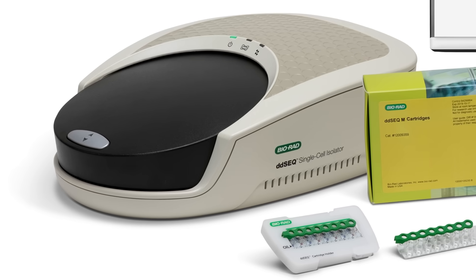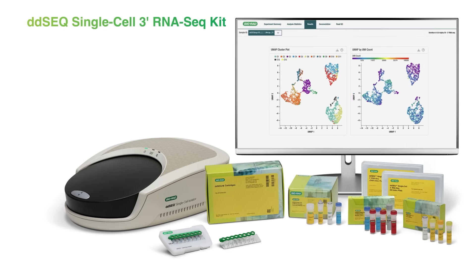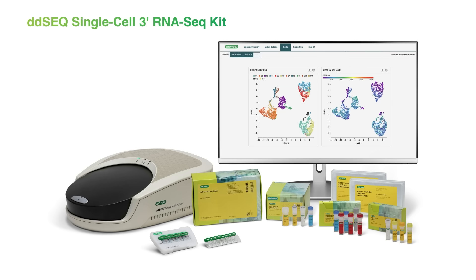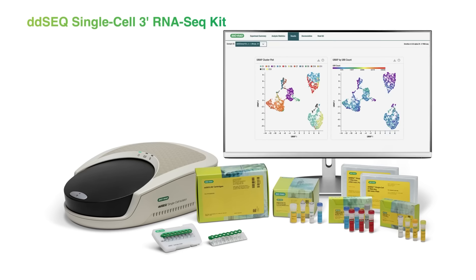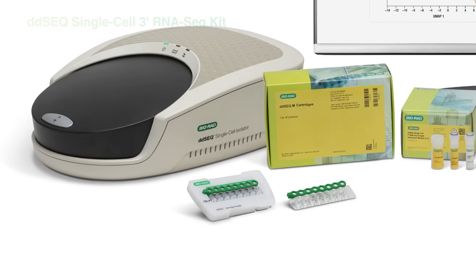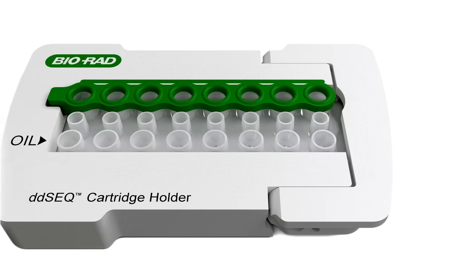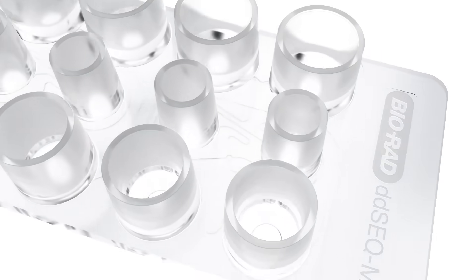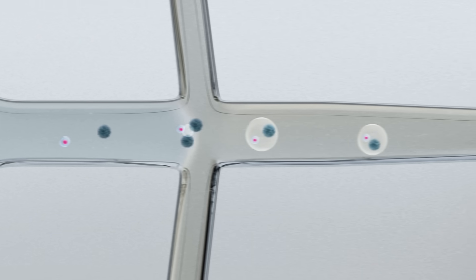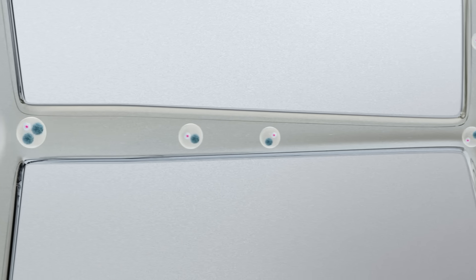Enter Bio-Rad's ddSEQ single cell 3' RNA-Seq kit, used with the ddSEQ single cell isolator and innovative oligo chemistry. Cost-effective, high-quality single cell 3' RNA-Seq libraries are created by encapsulation of single cells, barcoded beads, and reagents into droplets for gene expression profiling in just five minutes. Beads are overloaded in each droplet to ensure that every cell is matched with at least one bead, maximizing cell utilization and mRNA capture.